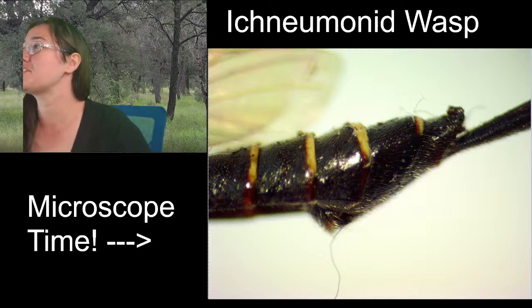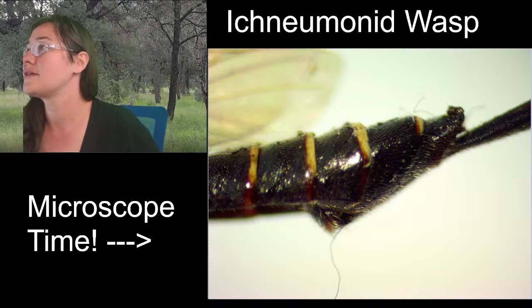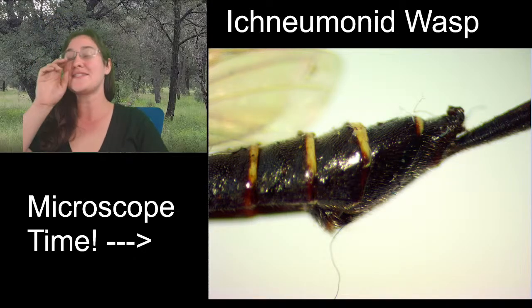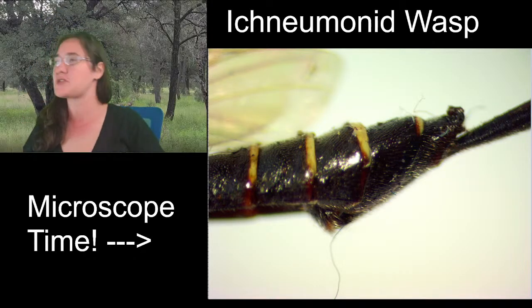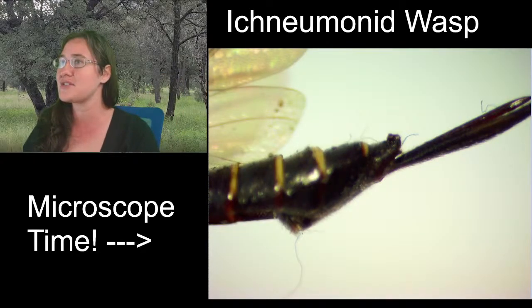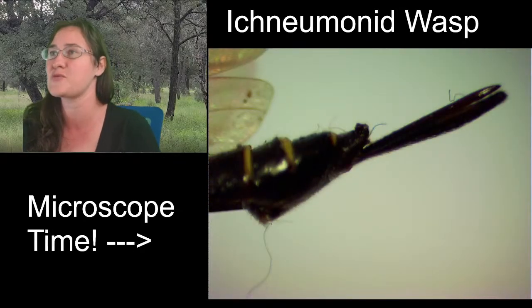Oh, I missed a little bit of chat. I think the pre-treatment would be to encase your entire body in latex. Huh. Nice sort of shingle effect of all those overlapping segments. Yes, exactly. So ideally, a lot of times in wasps, those segments overlap really nicely.